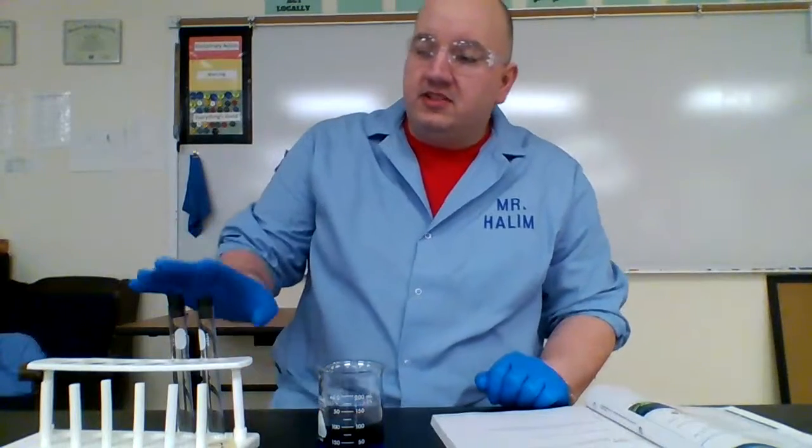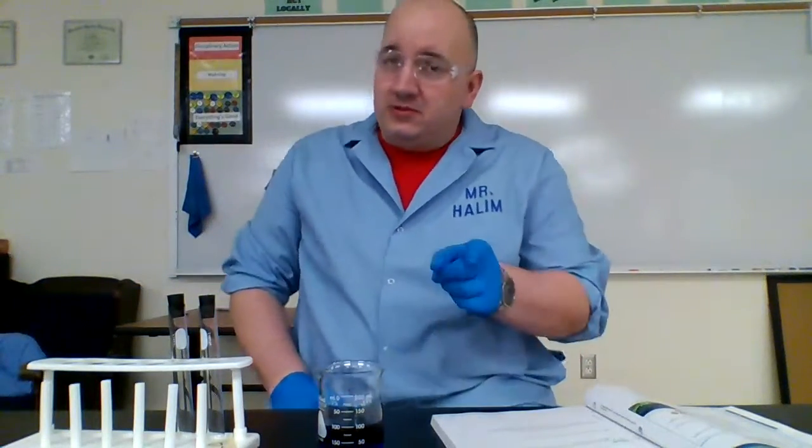All right, you're going to need only 2 test tubes on this one. The book says 3, but as a class, we're going to do just 1 control test tube per class. So each group is going to have 2 test tubes to actually test the independent variable, which we'll discuss, and I bet you can figure out which one that is.